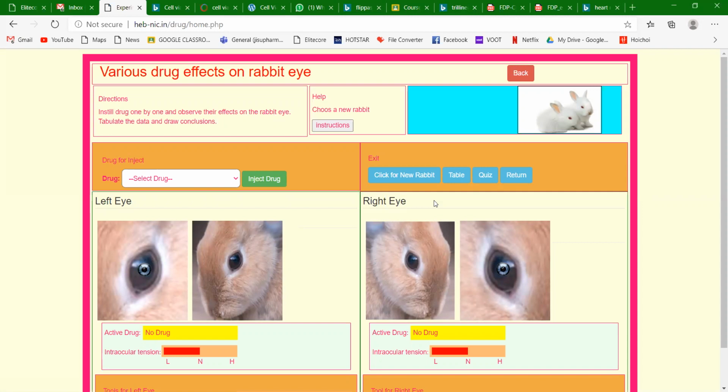One thing you have to keep in mind whenever you are doing an experiment, you need to have at least two batches of mice. In case you are doing any in vivo or in vitro experiment, one is control and one is test. And if the drug you are testing is a fully new agent, you want to see whether the agent has any kind of effect or not, then you need to have a standard one as well. So here the drugs have already been proven for such kind of effect, but still for your experience, we will compare it with normal saline.